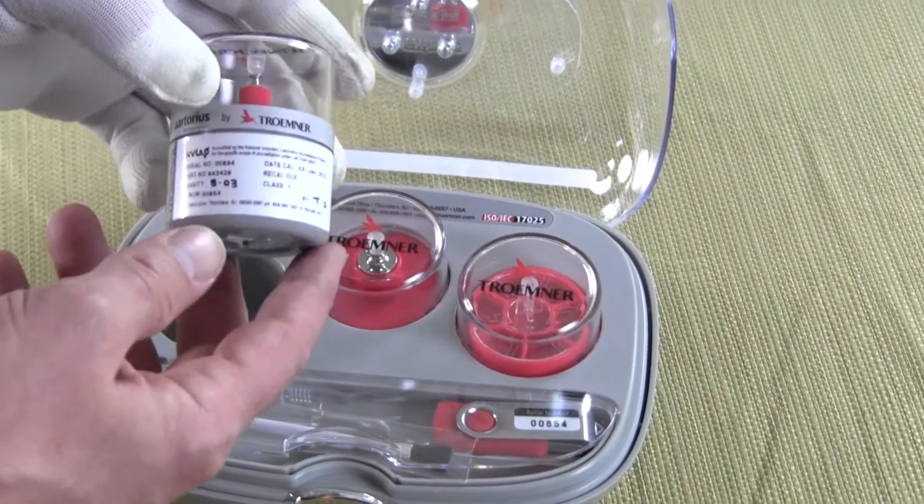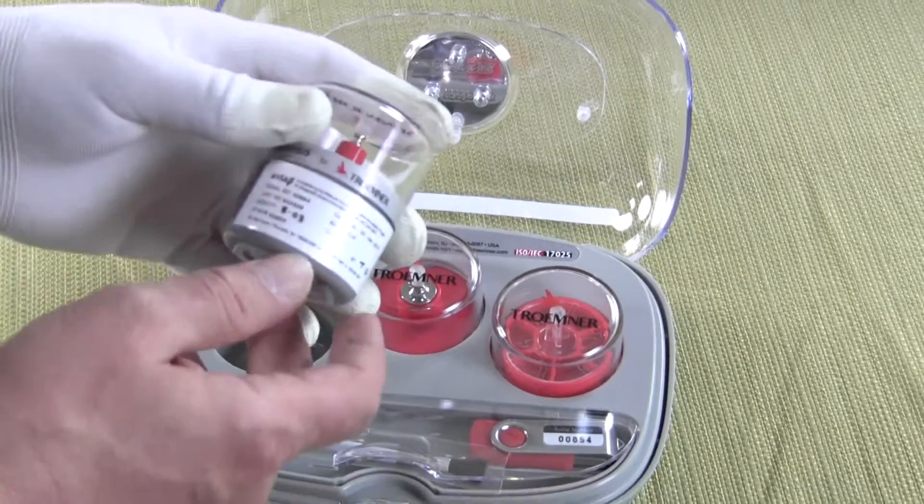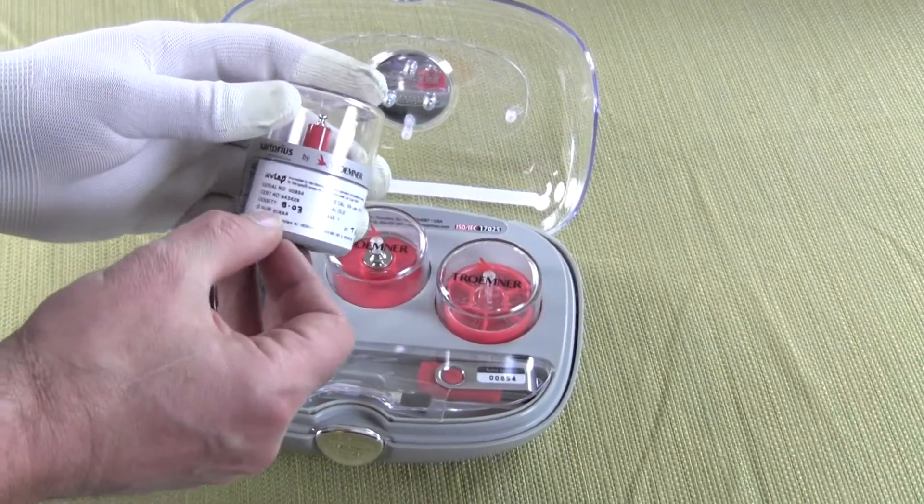Each one of these weights comes in its own separate container. You can see on the weight itself we have a serial number, a CERT number, the density of the weight, the CAL date, and the operator that did the calibration.